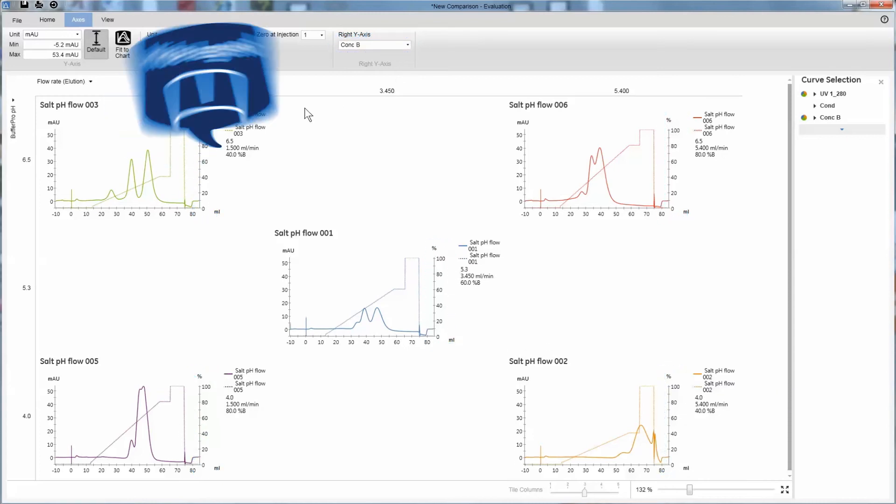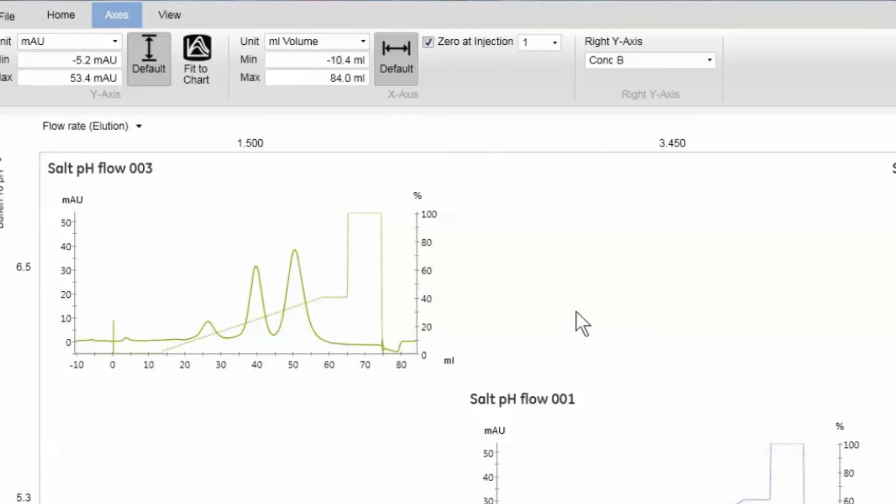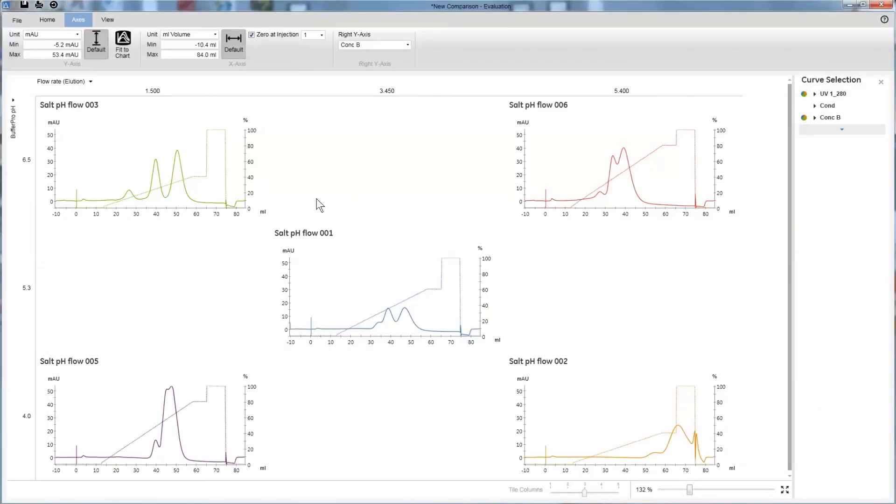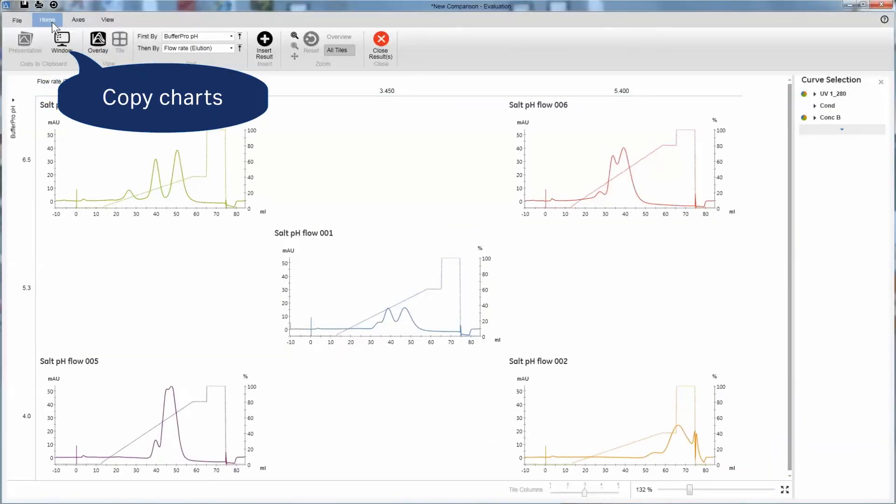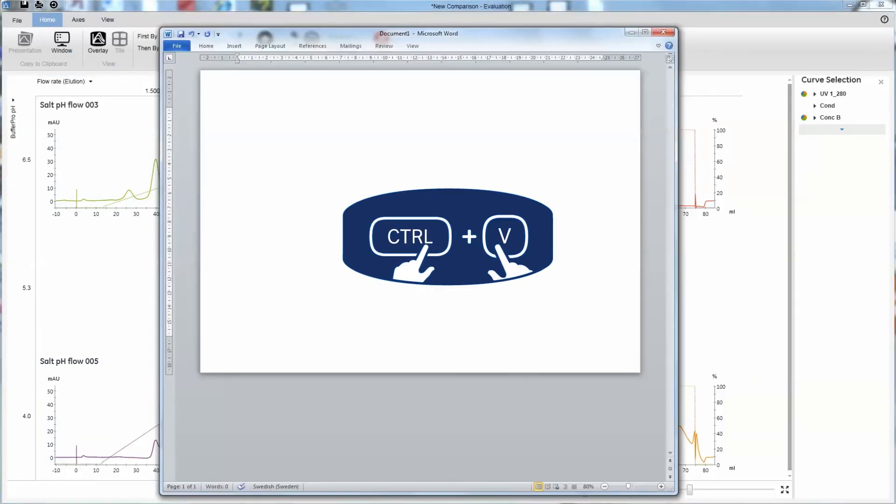If the legend feels redundant, you can remove it. Then, if you want to share your results, you can simply copy it and paste it into your application.